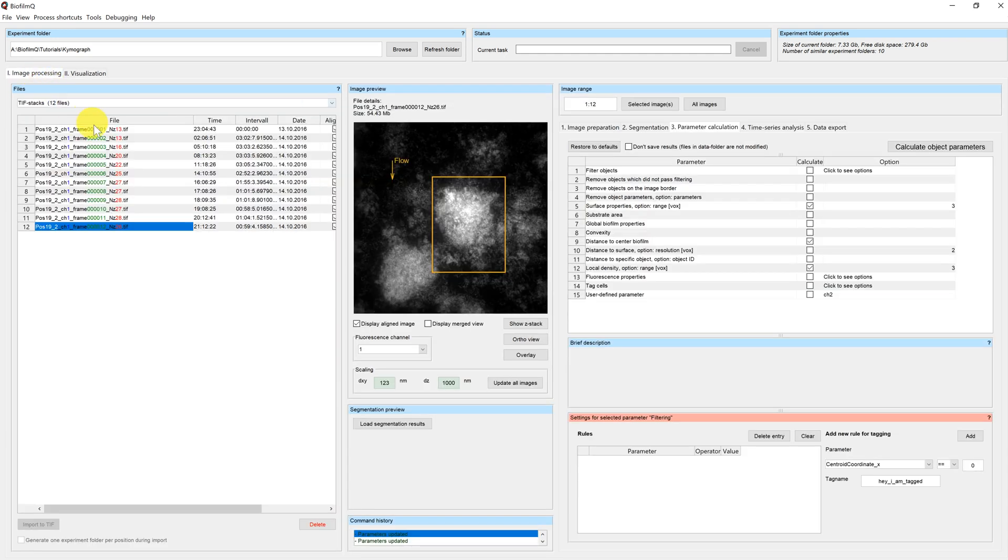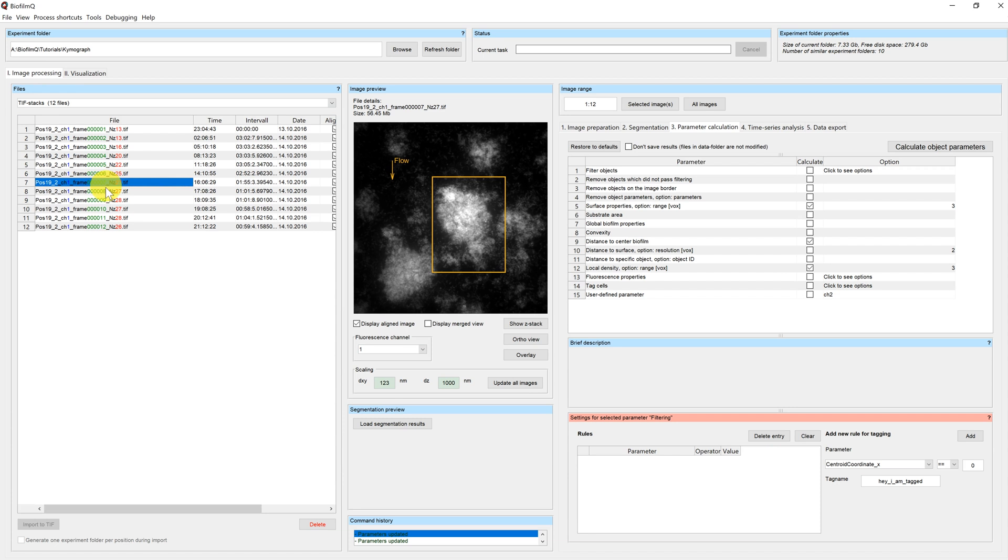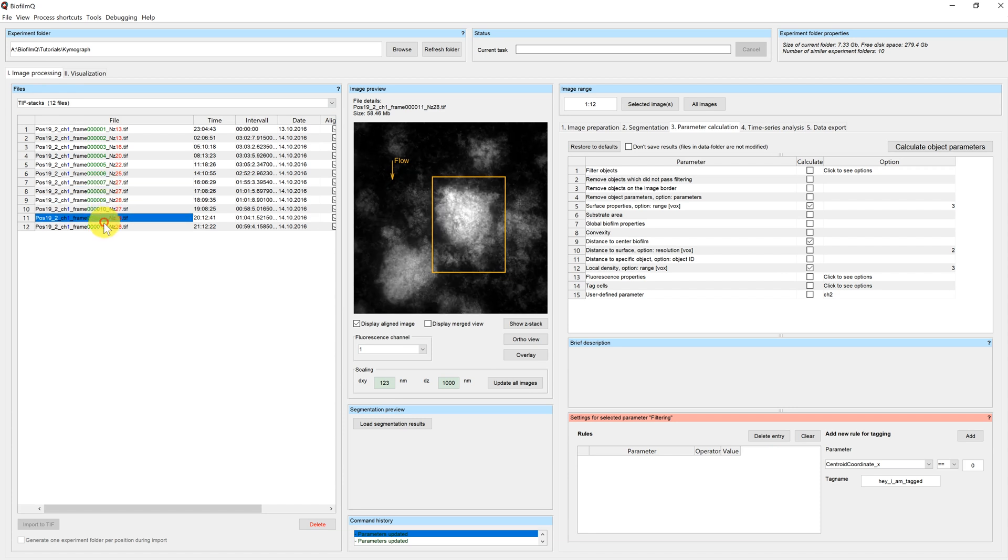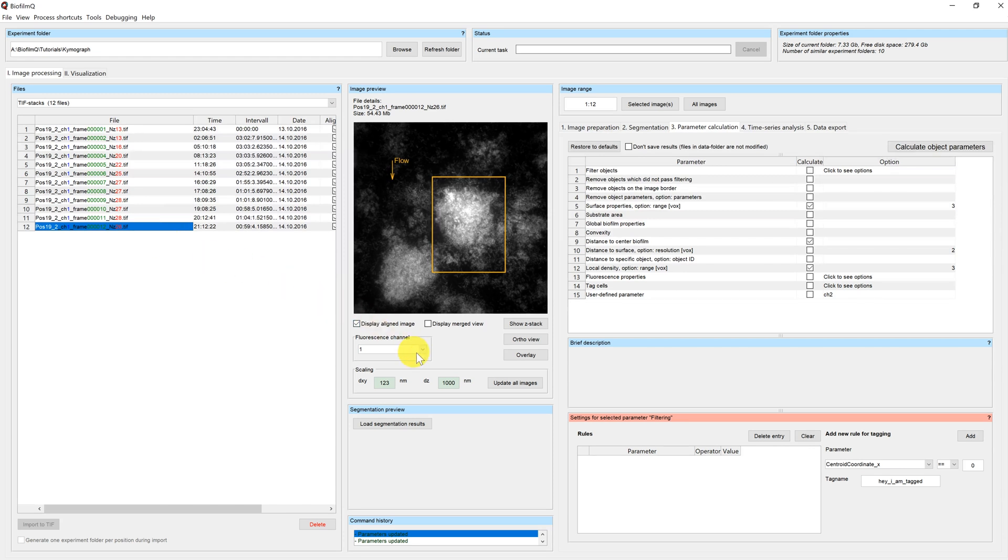In this directory we can see a growing biofilm. So we have a time series here. We also have two channels.